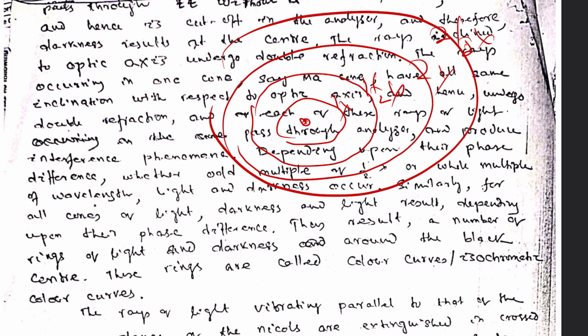So this is the dark center. Light ring, dark ring, light ring, dark ring. Dark ring for whole multiples of wavelength, color for odd multiples of half wavelengths. So here it will be colored, here it will be colored. In this fashion, we see that interference takes place and color is produced.